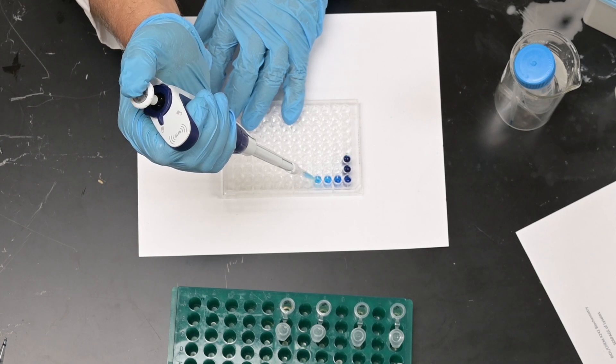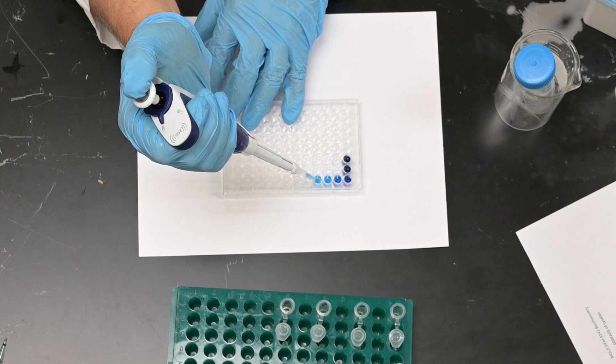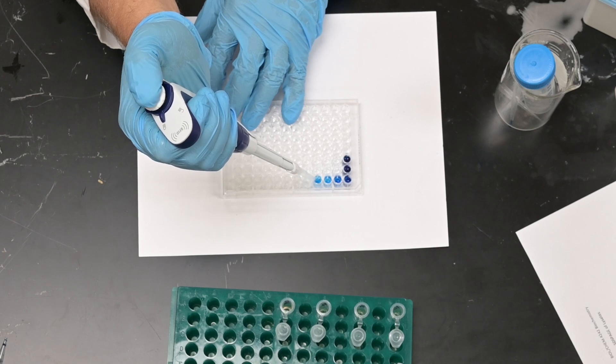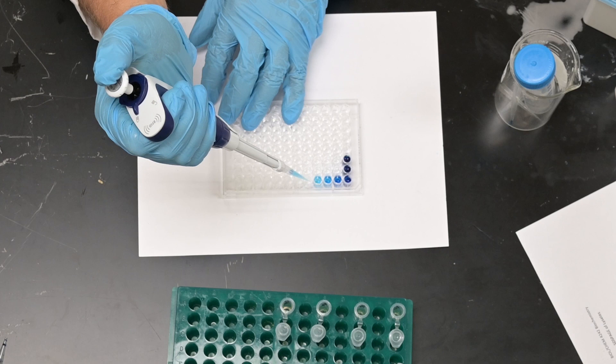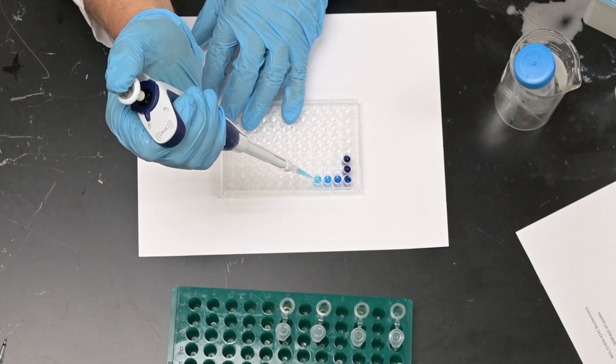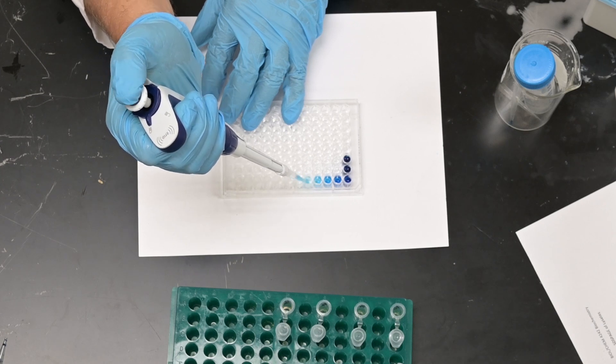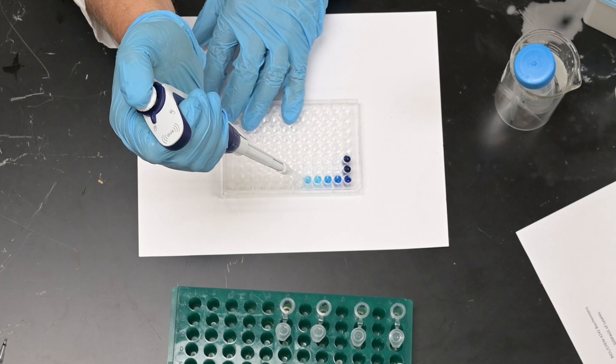We're only making twofold dilutions so I don't mix as much. If I was doing a tenfold dilution I'd be mixing a lot more. So I'm going from A4 to A5 and mix that up.